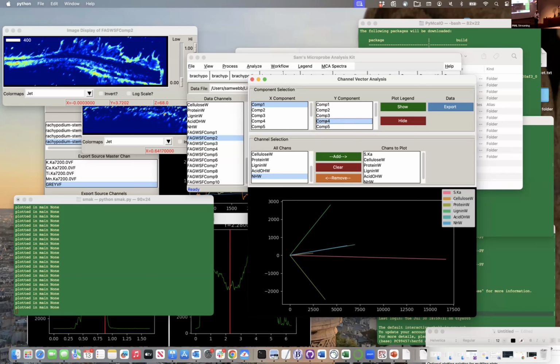But this is a much more complex sample, and those infrared bands don't actually match up with an exact potassium element or a sulfur element. And we might not expect that in this case, whereas in a carbonate system, that was a slam dunk. But now we can explore the interrelationships of the data set in a statistical way.